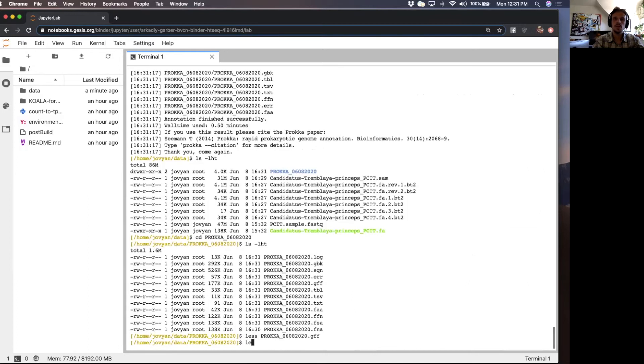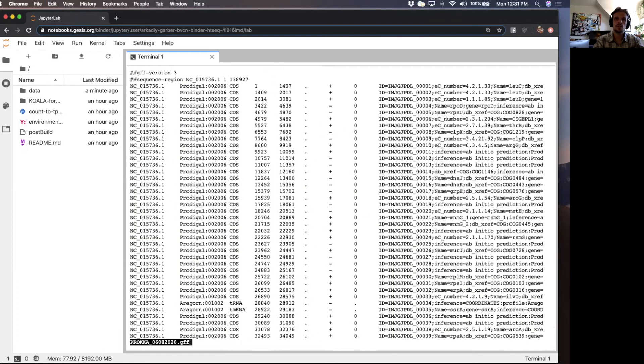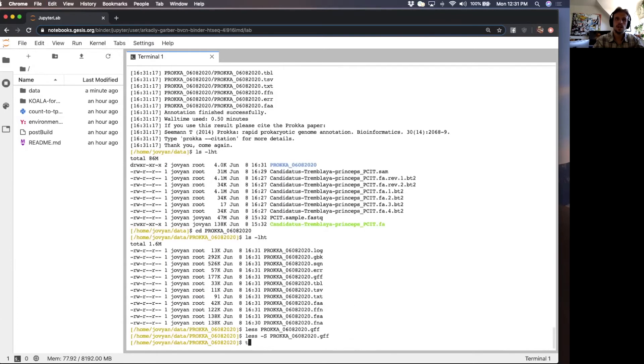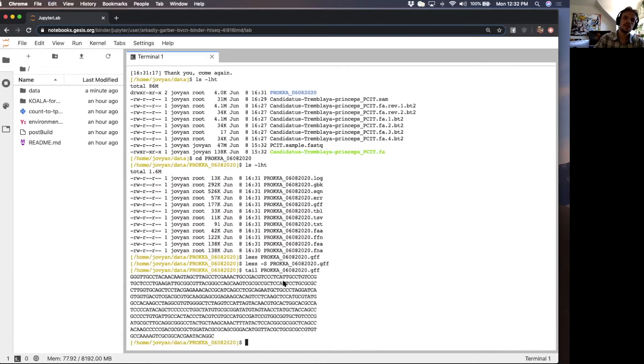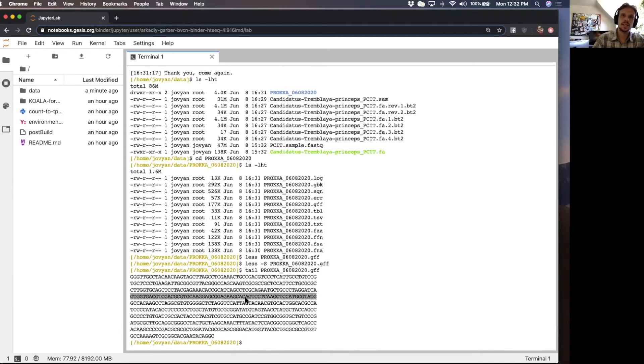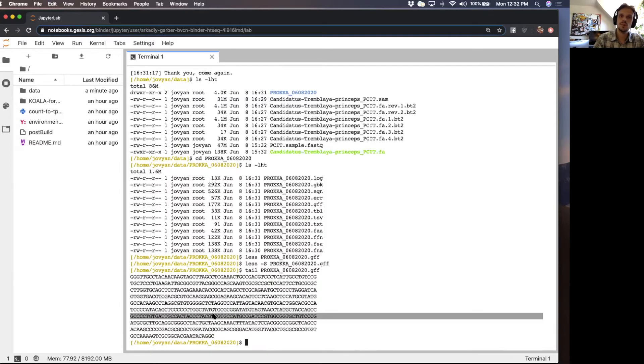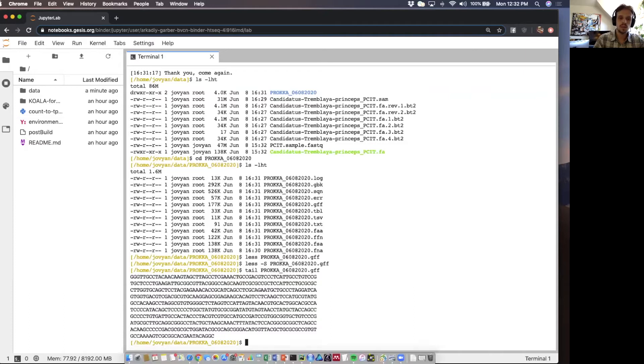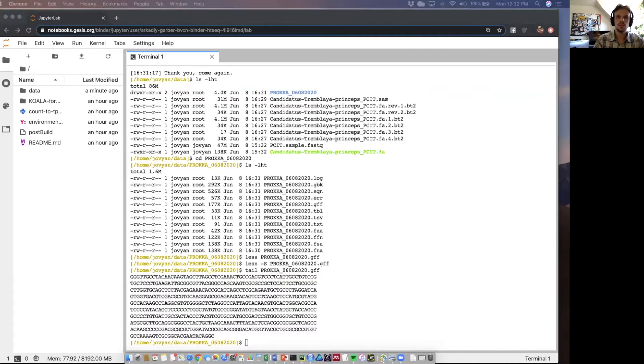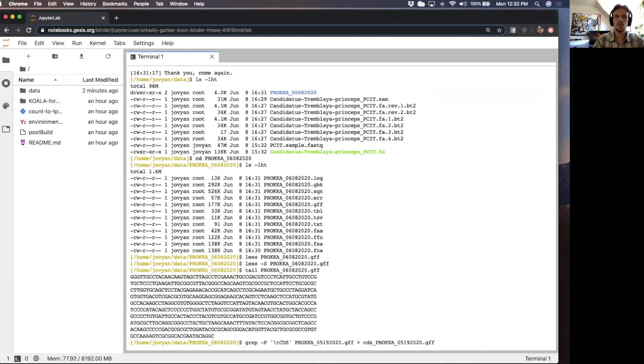When you create a GFF file using Proca, it actually includes at the end of the GFF file the actual gene sequences, the contigs you provide Proca. And that's actually a problem for HTCount. It took me a while to figure this out, but I was trying to use HTCount using this GFF output and it kept crashing. Then I realized that it really doesn't like the sequences at the end of the GFF file. So we can filter that out with a quick grep.